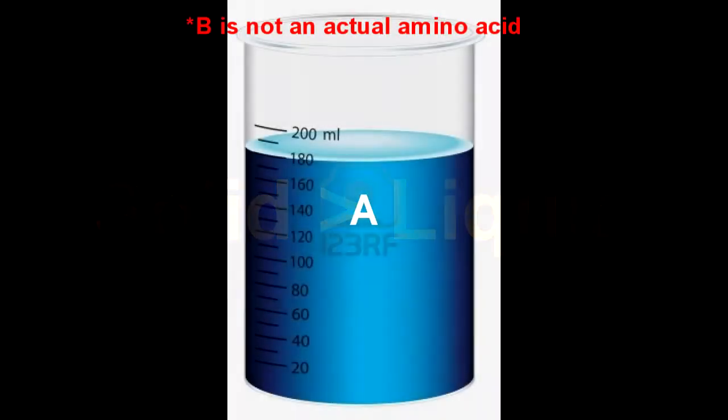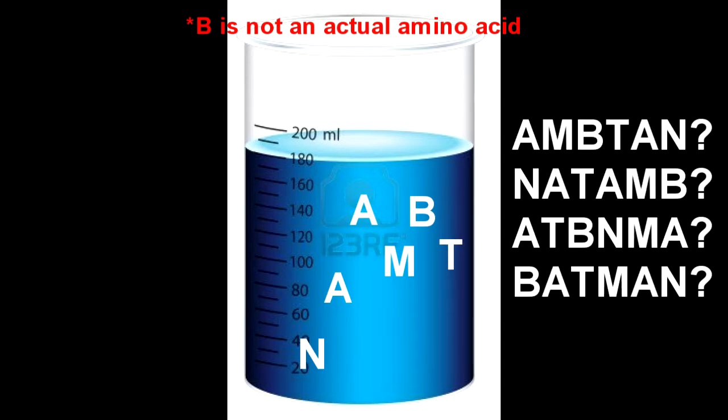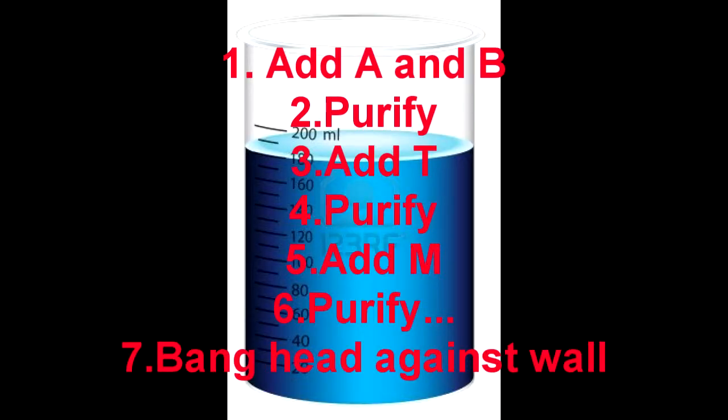Even at short lengths of 3 or 4 residues, we start to run into difficulties when using the liquid phase peptide synthesis techniques. If we simply tried to synthesize the peptide we wanted by adding in every single residue it is composed of, we can't be guaranteed at what order these residues will attach to each other. Therefore, we can assume that every permutation of arrangement could be present in solution. Circumventing this issue using a liquid technique would require repeated ligation and purification processes between each addition of an amino acid to the growing peptide chain. If our addition reaction and purification results in lackluster yields at each step, the end result is we will have a low yield for the peptide we are trying to produce.